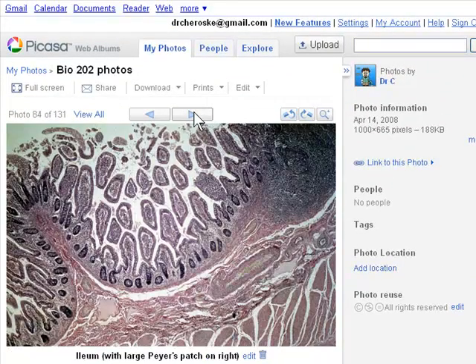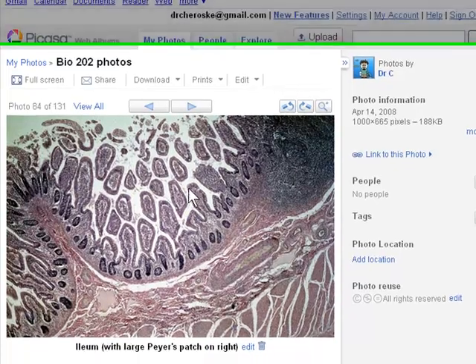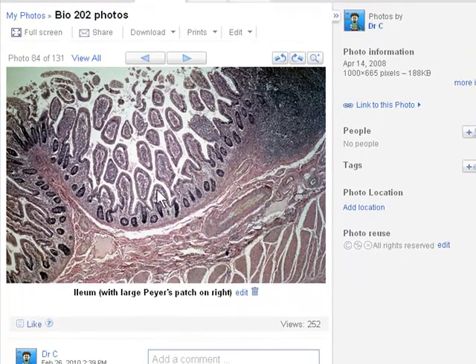All right, so we move to ileum now. Ileum, same thing. We're going to see the finger-like projections like you see here. These are the villi, okay? But we also see these very sharp folds, circular folds that occur in the intestine as well. Now, these are in the duodenum or the ileum, but this one is just being shown in the ileum slide right now. But this right here is either called a circular fold or a plicae circulares. And you'll see it listed in the lab manual. And you'll also find this on a model as well. Okay, so there's a plicae circulares.